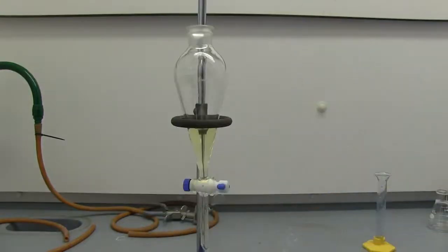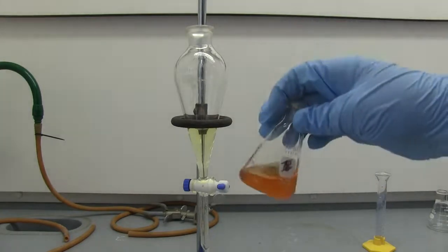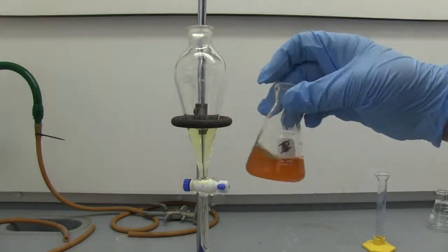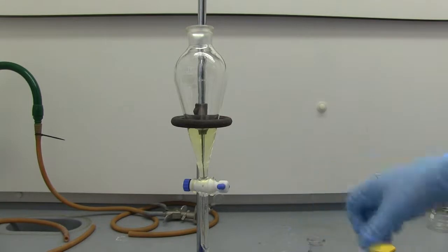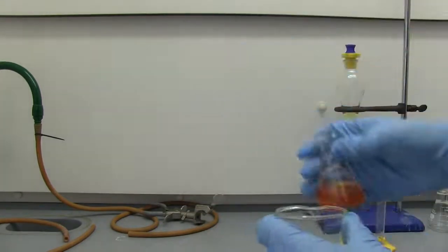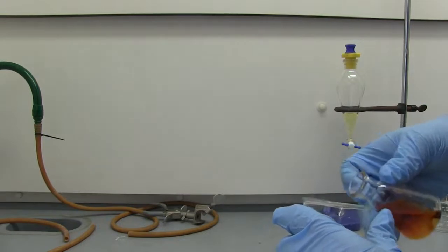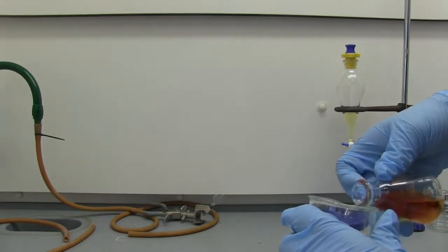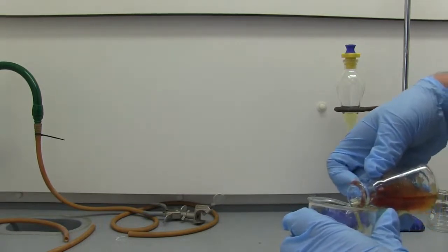So now that we have our dichloromethane extracts, we are going to dry them with some sodium sulfate and then transfer it to a beaker to evaporate. All right, so now we will decant our solution into a beaker, trying to leave all the sodium sulfate behind.